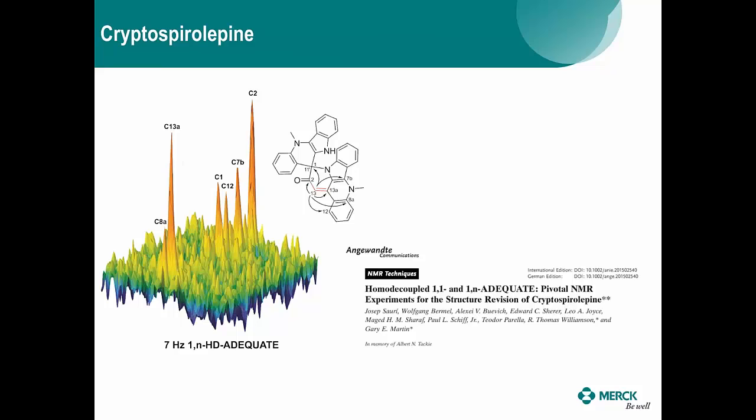And first of all, I want to start with this compound that is an alkaloid by the name of Cryptospirolepine.